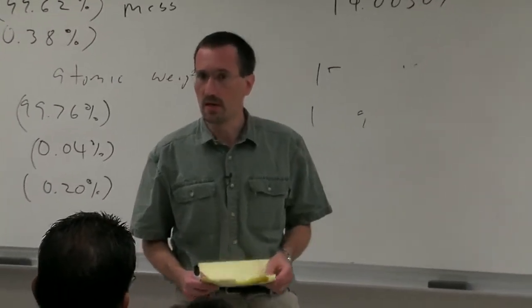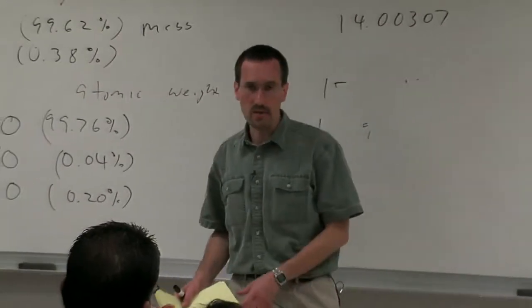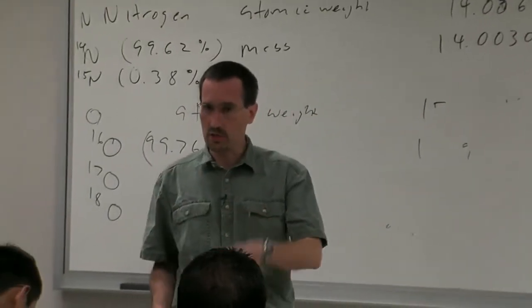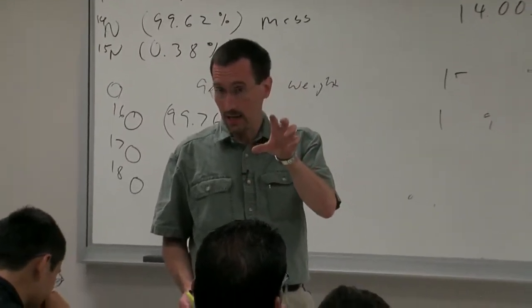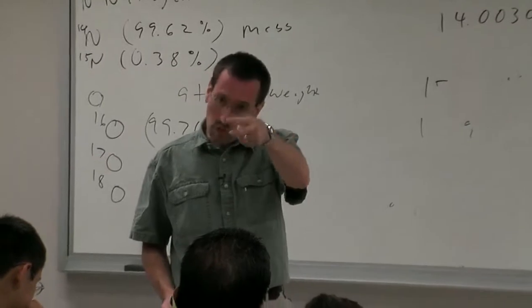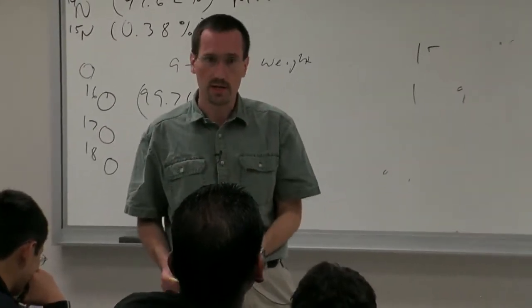And if you have a multiply charged species, say with 2 protons on there, so a mass to charge that's based on being a dication, then you'd add in 2 protons or 2 sodiums or a sodium and 1 proton in.